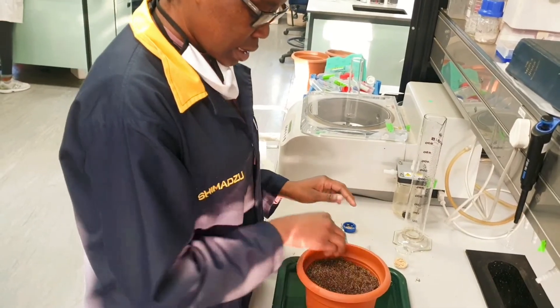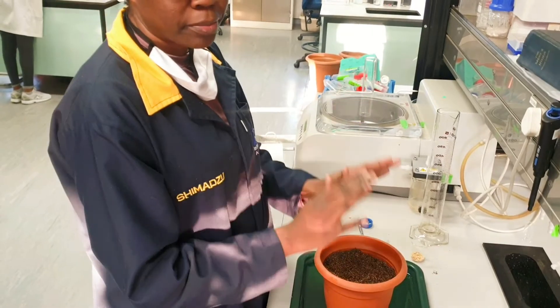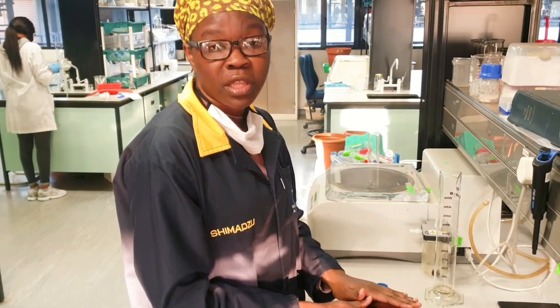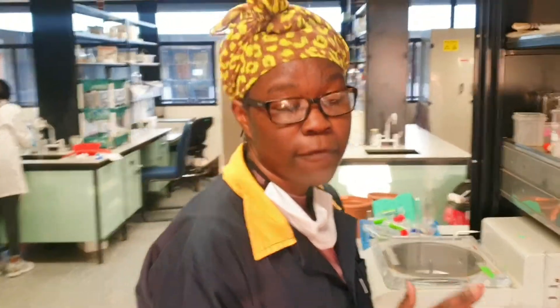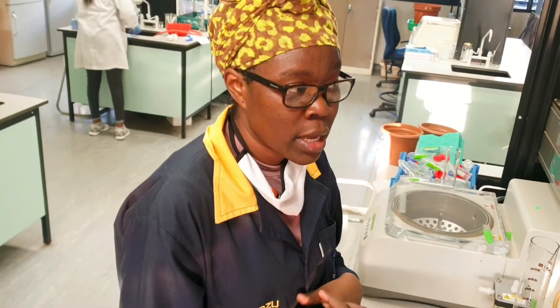Now that this is done, I'm going to put them in a controlled plant room where they will germinate. It usually takes four to six days to germinate. Because I'm doing metabolomics, I let them grow for 21 days, but you can let them grow for one week, two weeks, or even longer depending on the question you want to answer.